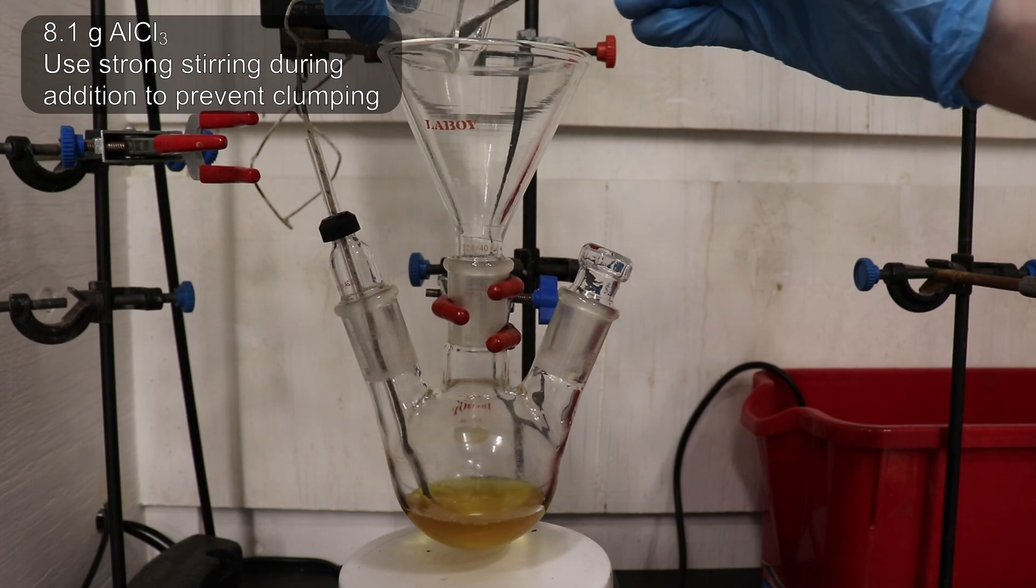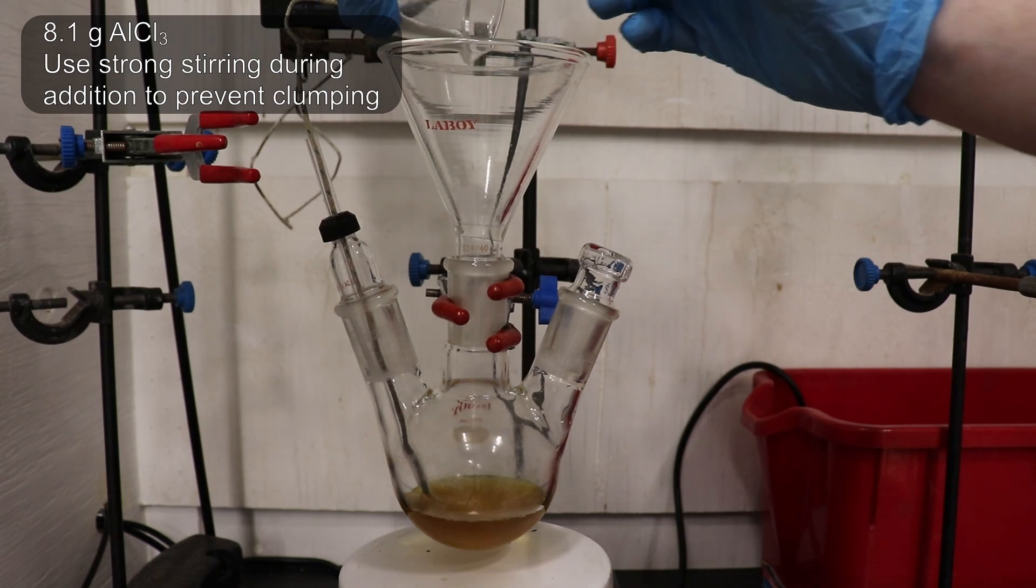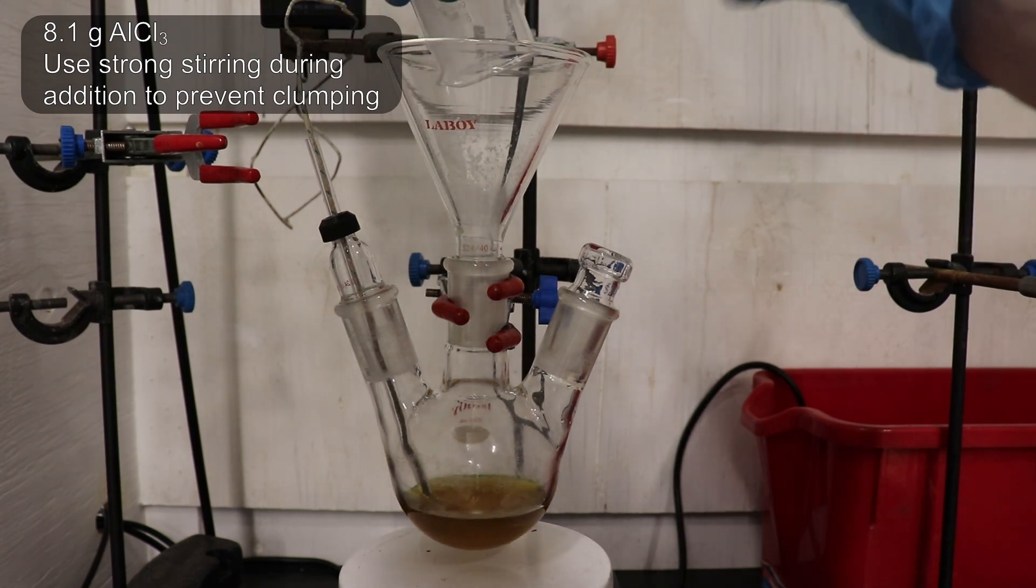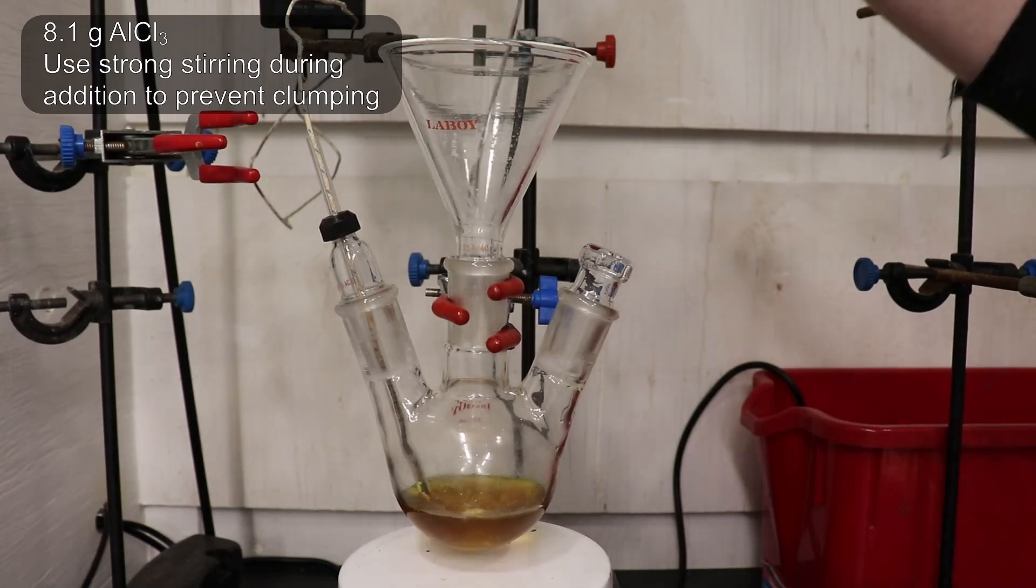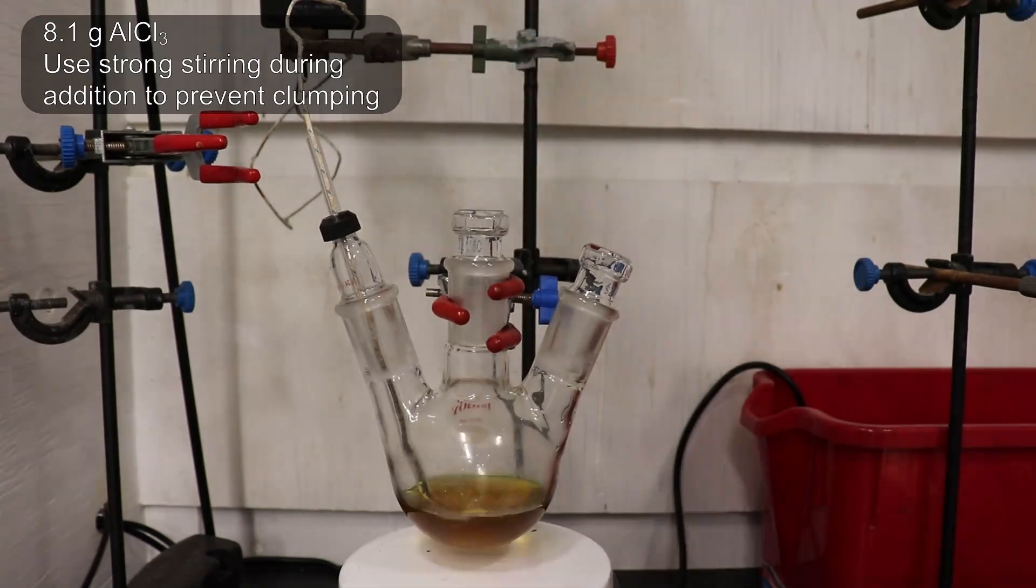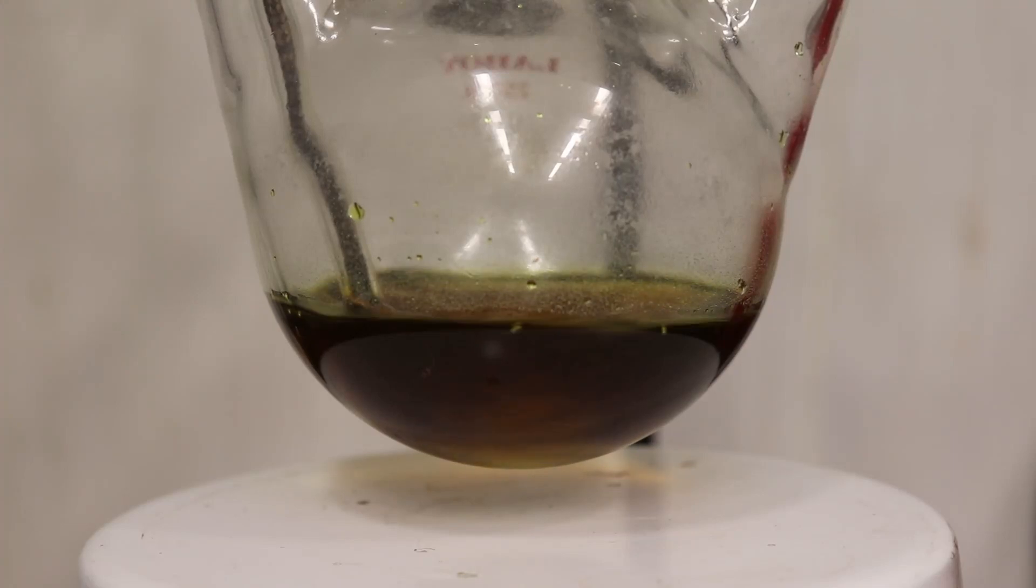So then, with strong stirring, 8.1 grams of aluminum trichloride was added to the nitrobenzene and allowed to fully dissolve. Remember to minimize the handling time of aluminum trichloride in air, as it is sensitive to atmospheric moisture.